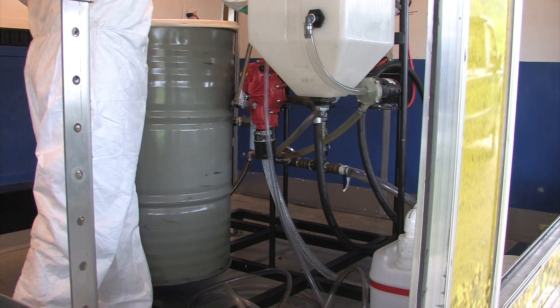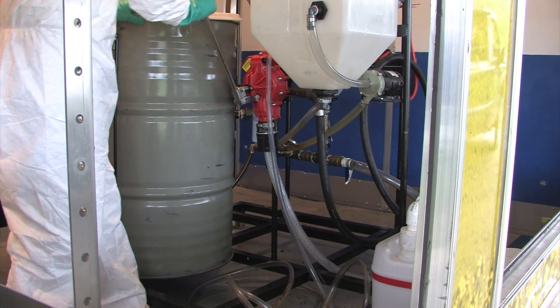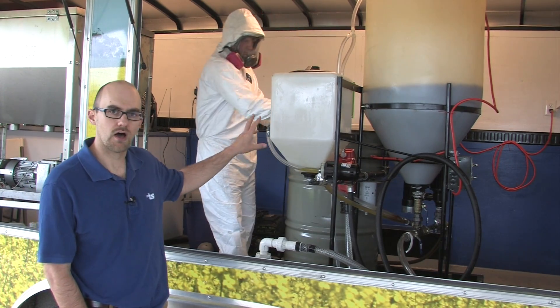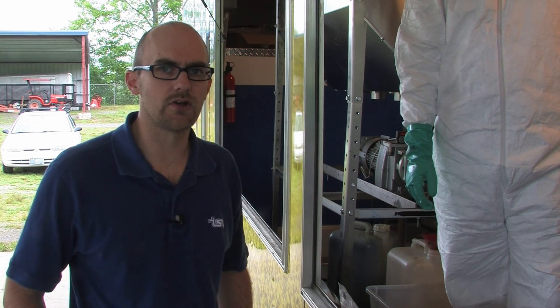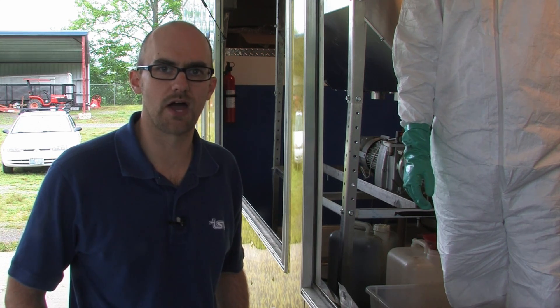Richard is using the biodiesel processor right now to pump some methanol into the smaller cone bottom tank that you see here. We've added the methanol — usually when you're adding methanol it depends upon the amount of oil you're using. You want to add about 20% of the volume of oil that you're trying to convert to biodiesel. In our case we've got 20 gallons of oil, so we would want about 4 gallons of methanol.